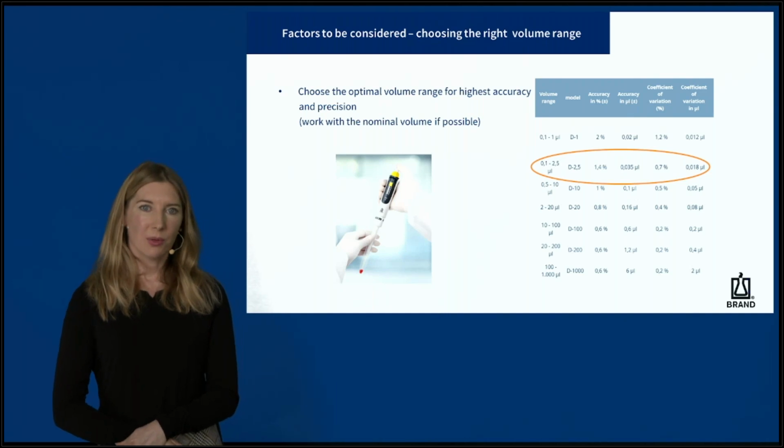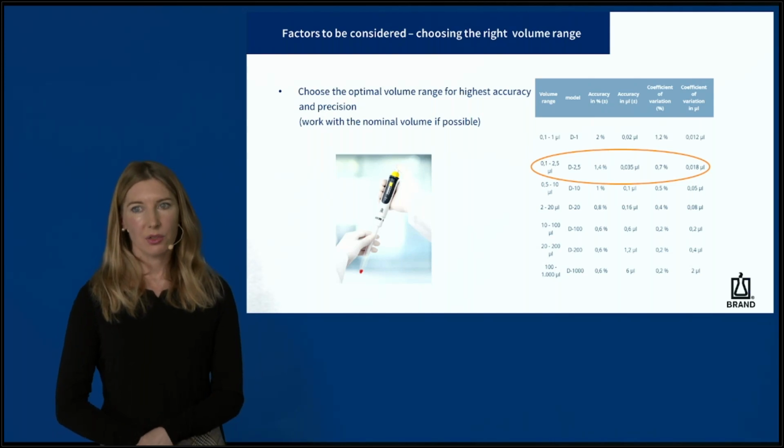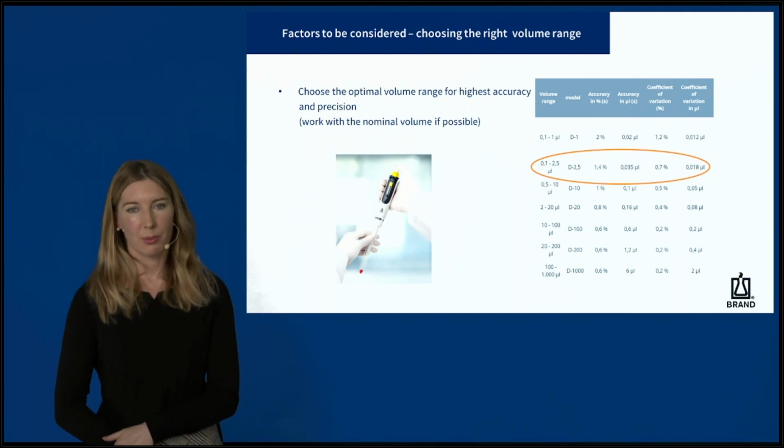This example shows that it really makes a difference to work in the upper or lower volume range. This should be taken into account in the choice of the pipette.